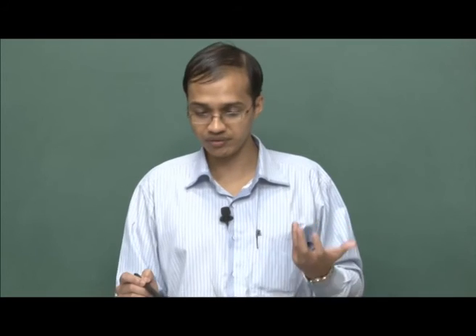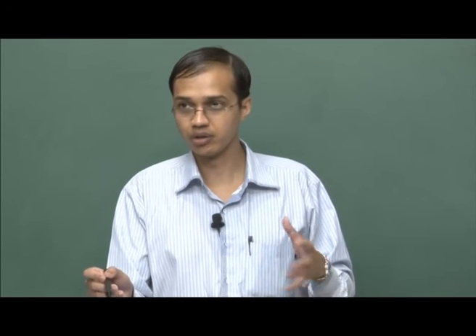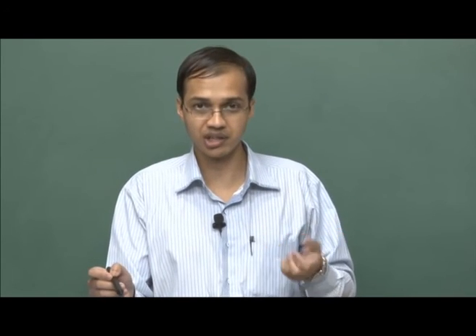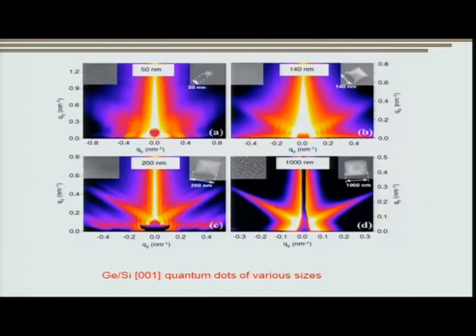Now, I would like to emphasize that carrying out SEM and the like is very difficult. We have to stop at each and every stage and then analyze the sample. However, grazing incidence small angle X-ray scattering probably offers the only technique wherein you can monitor the evolution, the growth of particles, or catalysis or chemical reactions occurring at the surface in situ. So, this is the only technique that gives you real in situ information.